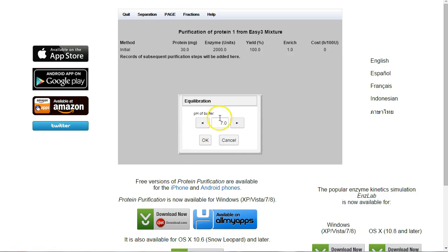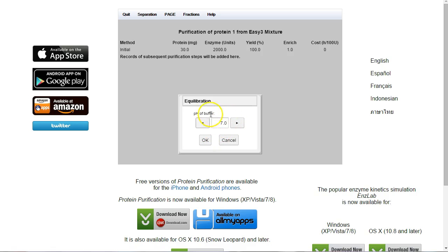From the 2D gel, when we draw the line at pH 7, what we discovered is that our protein was positively charged. So it's not going to stick to the column. It's going to go straight through. So we're going to keep our pH at 7, and click OK.